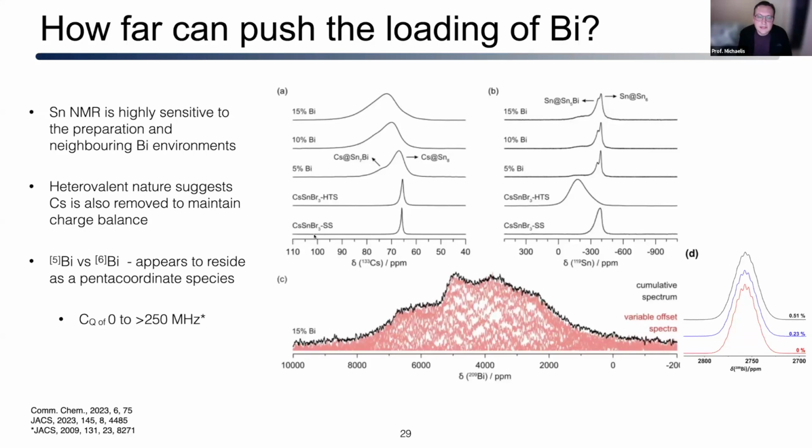Brian Lucier, you asked this, the observation of J coupling in some of these spectra is interesting. Was there any additional structural or material information yielded from these? No, not really, unfortunately, Brian. All we do know is that at times the J coupling is observable, and at times we can try to measure it. I think in this bismuth chloride example, we do mention that in the paper, although I don't recall what exactly it was. But most of the time in our materials, we do not see the J, but we know it's there.